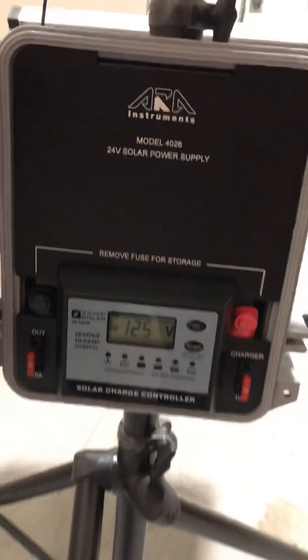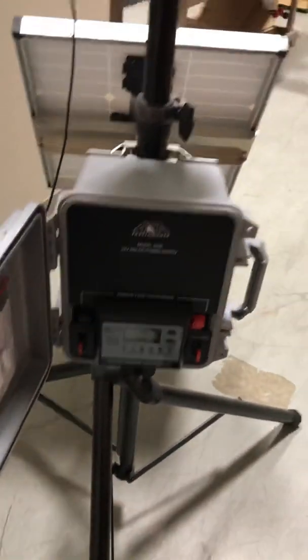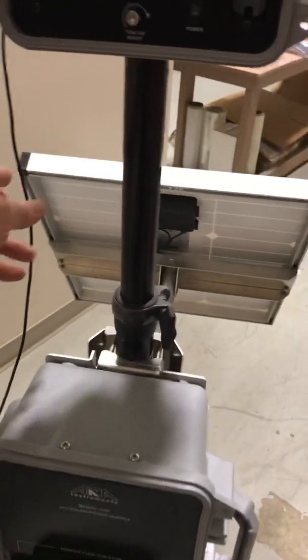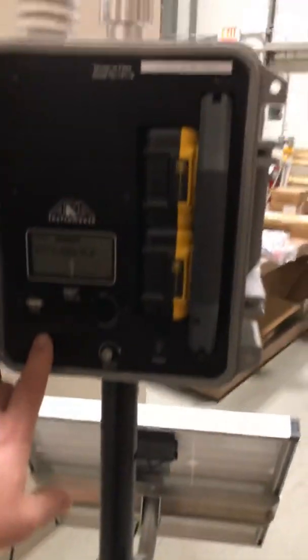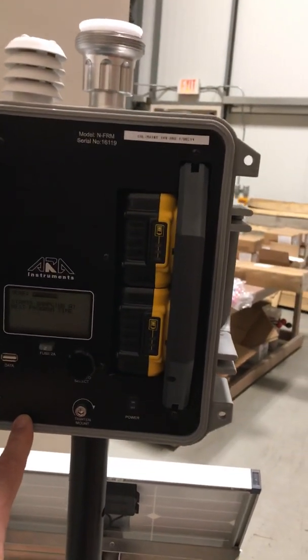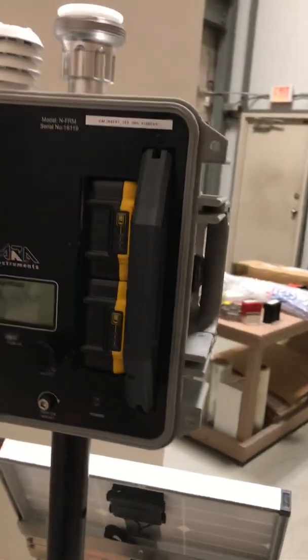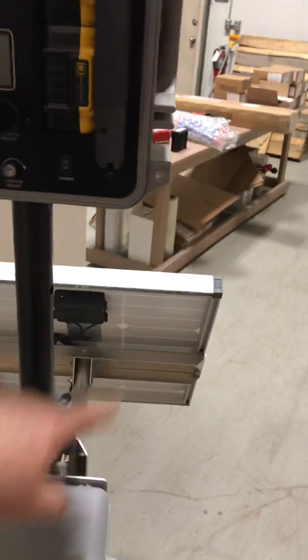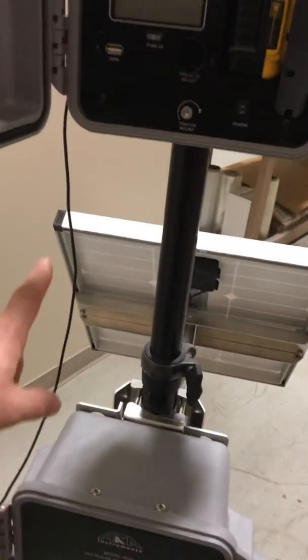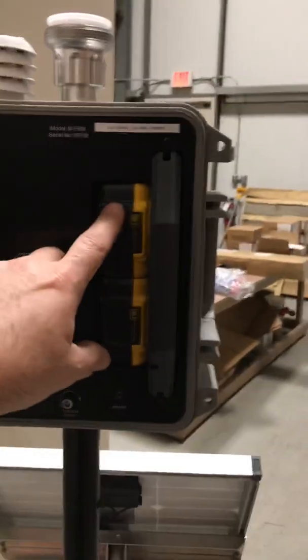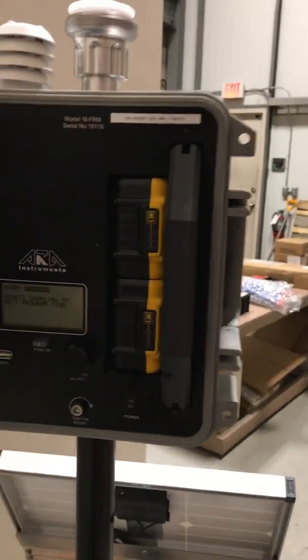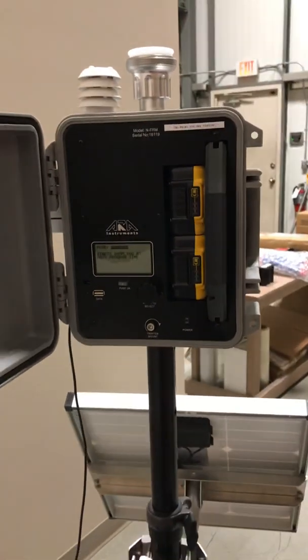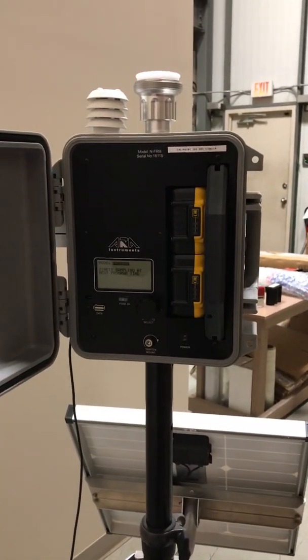So this solar panel power supply will send power through this cable into the particulate sampler module. This module will charge these battery packs right here. These are standard DeWalt battery packs, very simple to pull out, recharge them on a charger like you would your drill, and slide them back in.